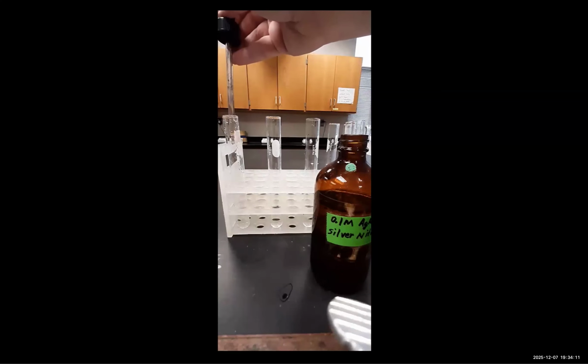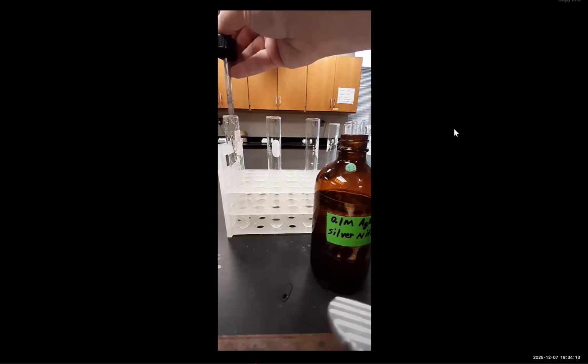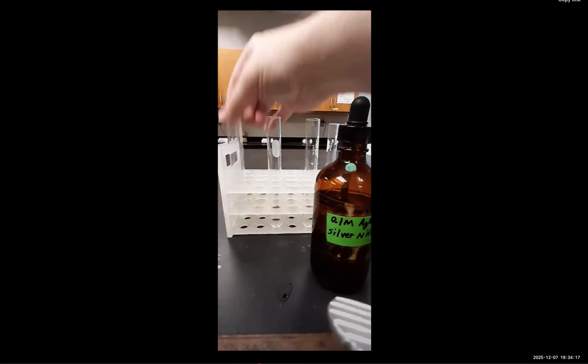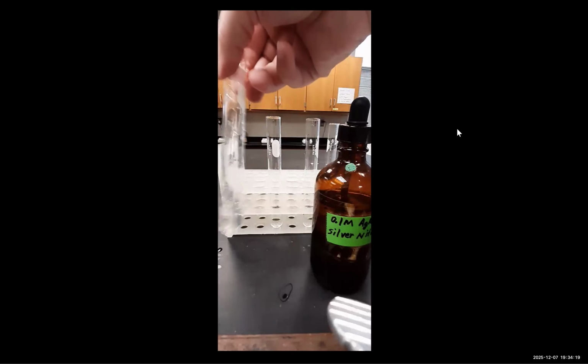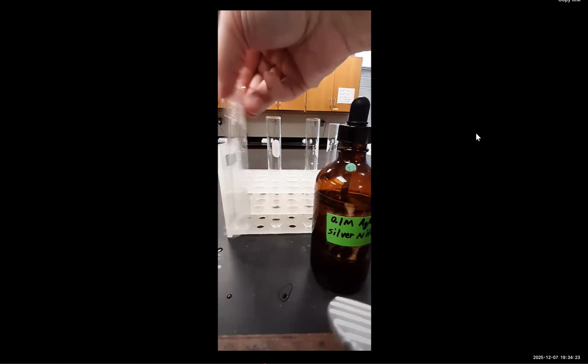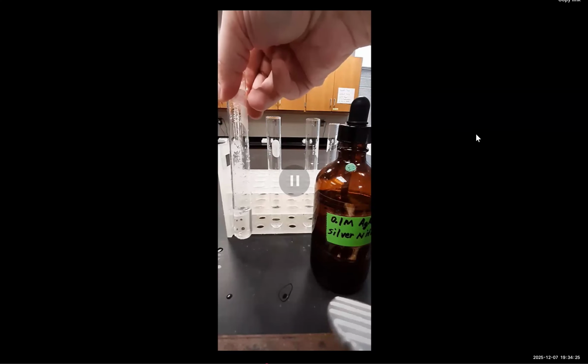So here's what the chloride test looks like. We're using silver nitrate. We're testing for chloride. And as you can see, when we tested the deionized water for chloride, do we see any white solid? I don't see much of anything. So I'm going to write down that observation.